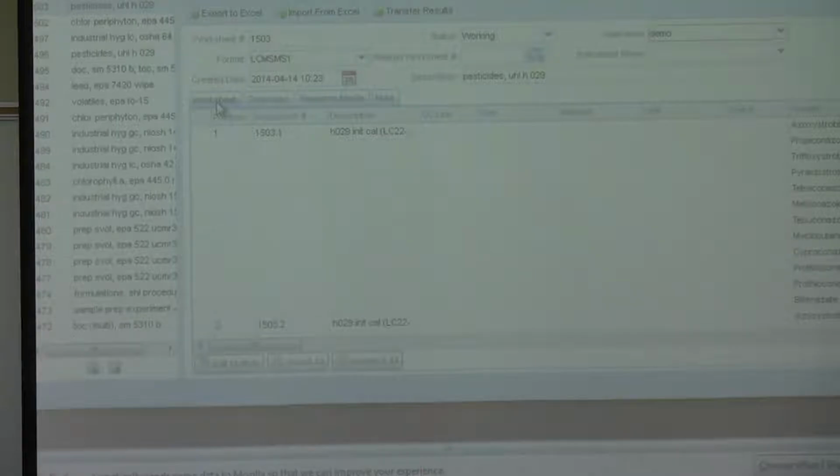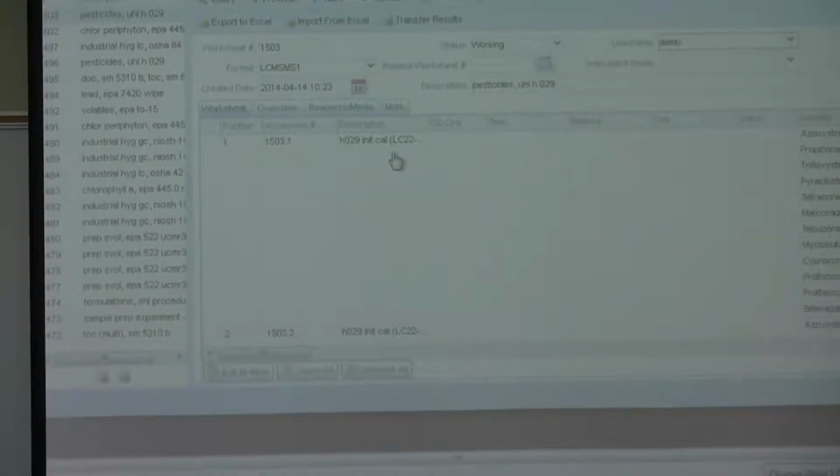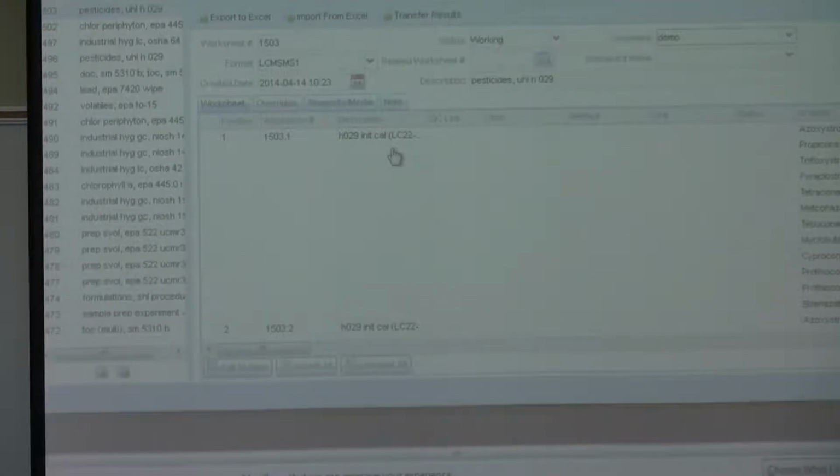Okay. Any questions about my really, really quick run through of query? Not everybody can make the QC, right? Correct. That's still the same? Still the designated group of people that can do QCs.